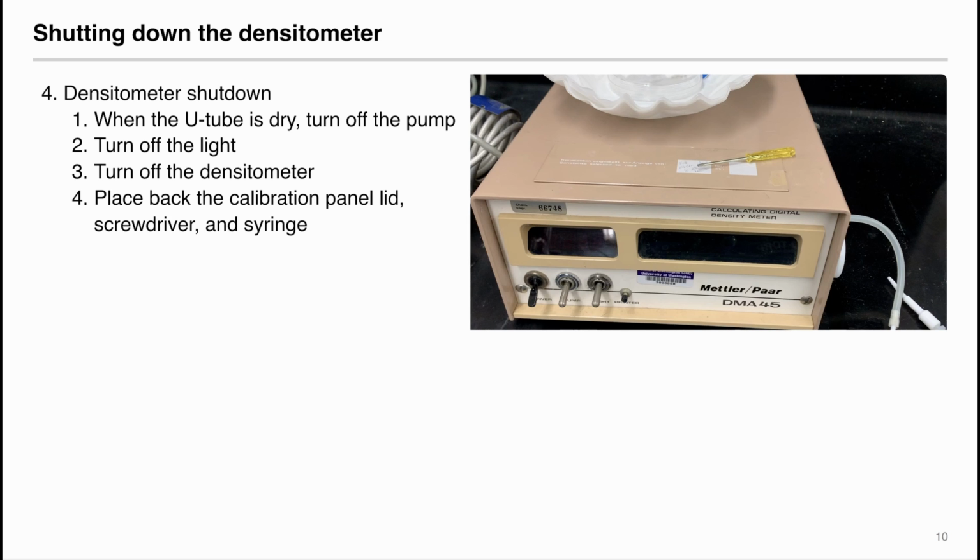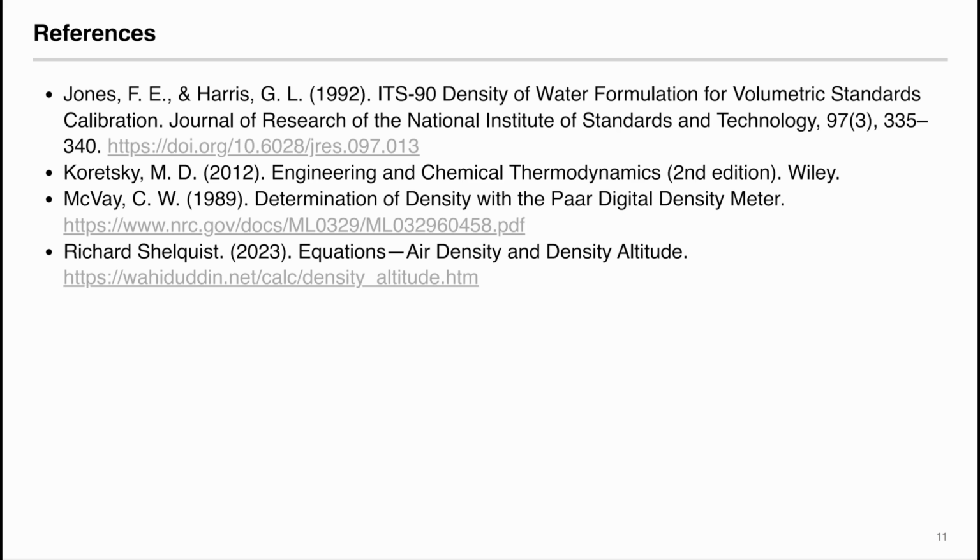In this video, I went over the theory for calibrating a densitometer that correlates the vibration period of liquid with its density. I also went over the practical procedure for using a densitometer to measure the density of liquid of interest.